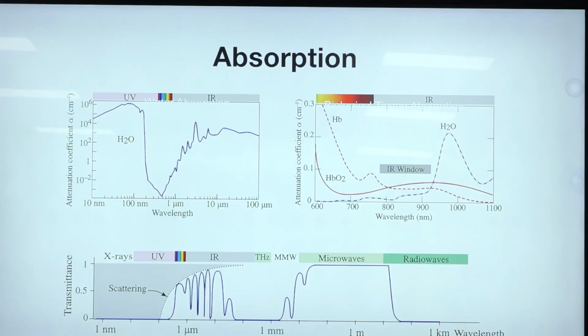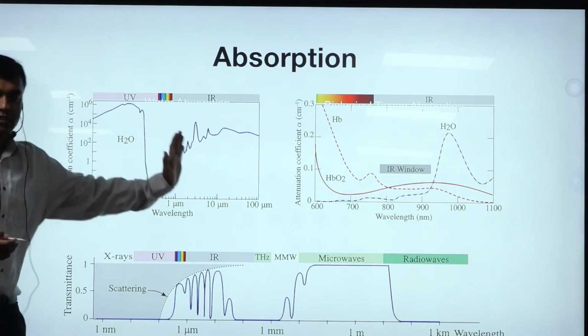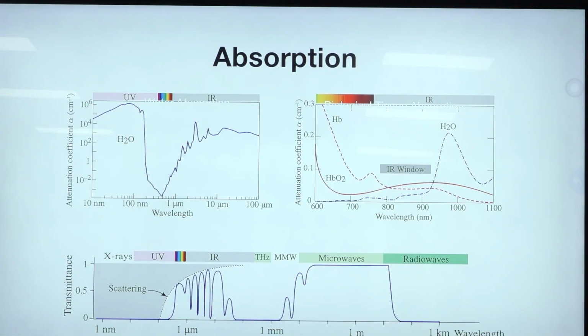The basic idea of spectroscopy is that you make a measurement, say, of absorption at one wavelength, then another wavelength, and make a plot of this absorption. There is a specific pattern to the absorption. Some wavelengths may be selectively absorbed, some may not be.